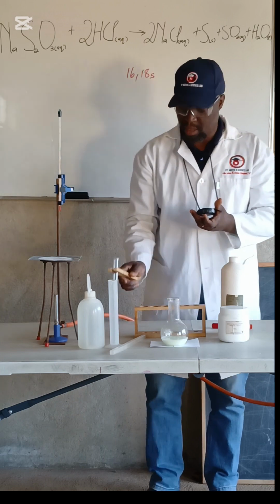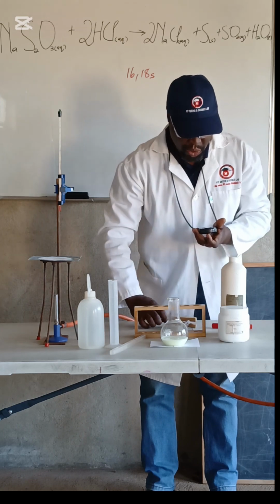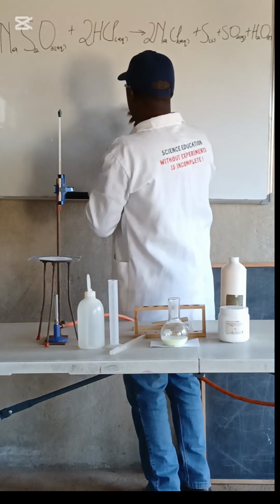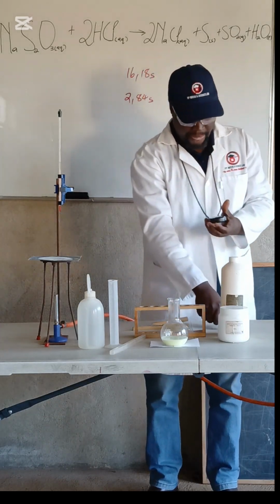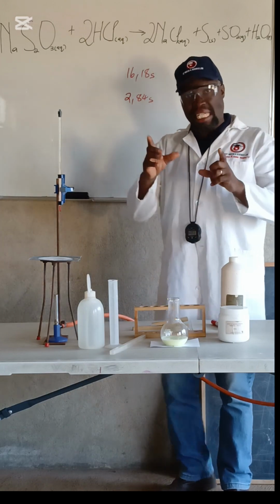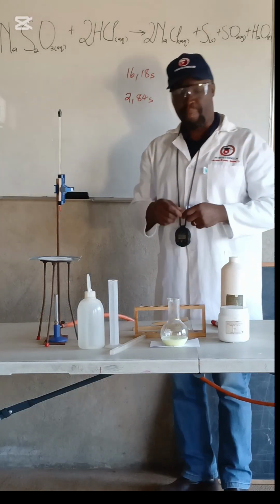That was quick. This one did not take a long time. It took about 2,84 seconds. We can safely conclude that an increase in temperature increases the rate of a chemical reaction.